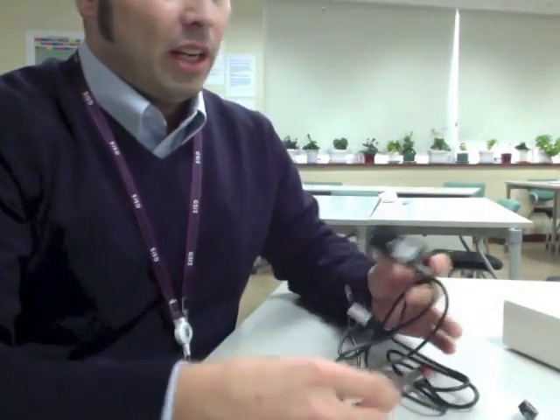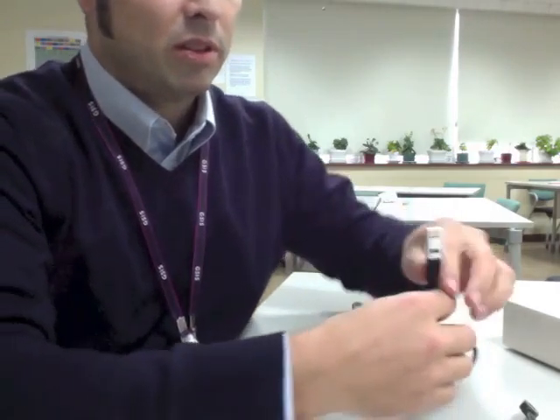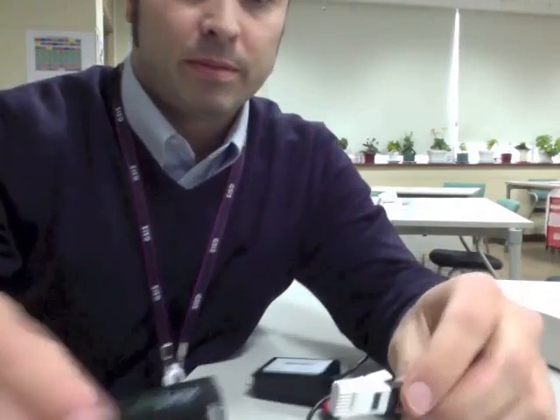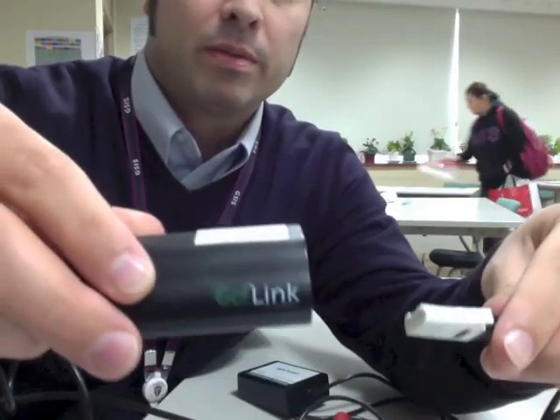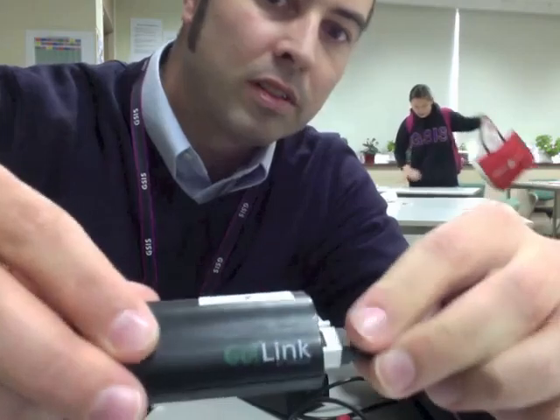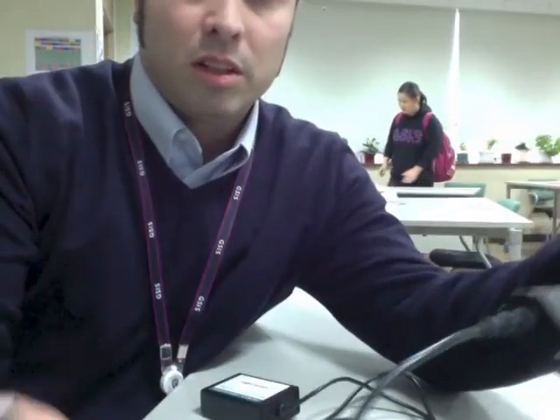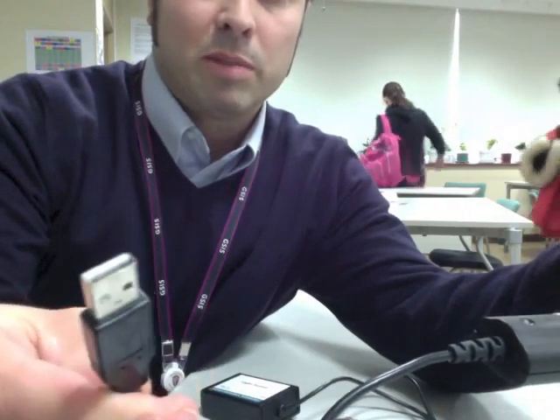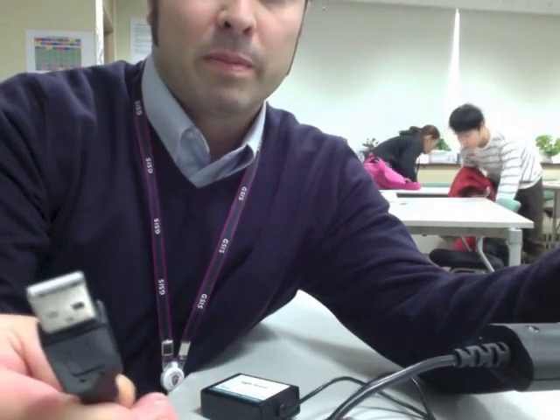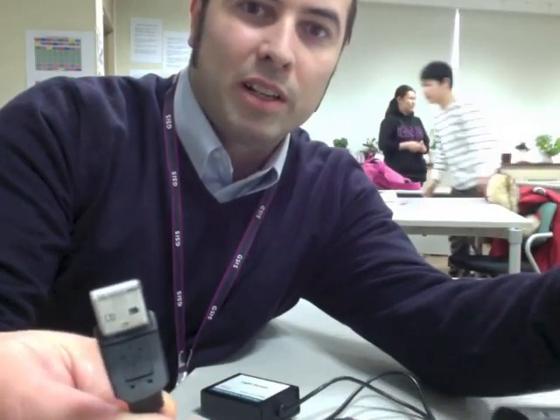Go ahead and connect your probe to your Go Link, like so. And I'll click in there, and then you can attach your USB port to your computer, and if you have Logger Pro up and ready, it should be ready to go.